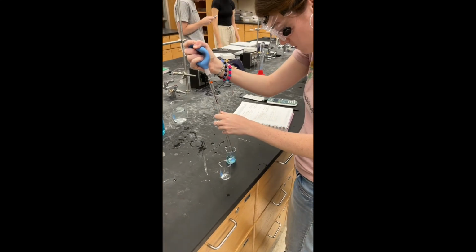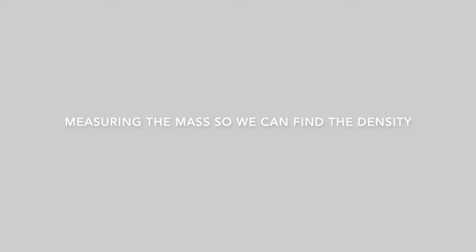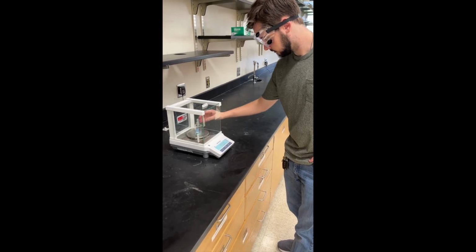As explained earlier in the video, our given experiment should use 25 milliliter volumetric flasks. However, due to an equipment limitation in the laboratory, we opted for 25 milliliter beakers instead. In the next section, we will discuss the results of our procedure.